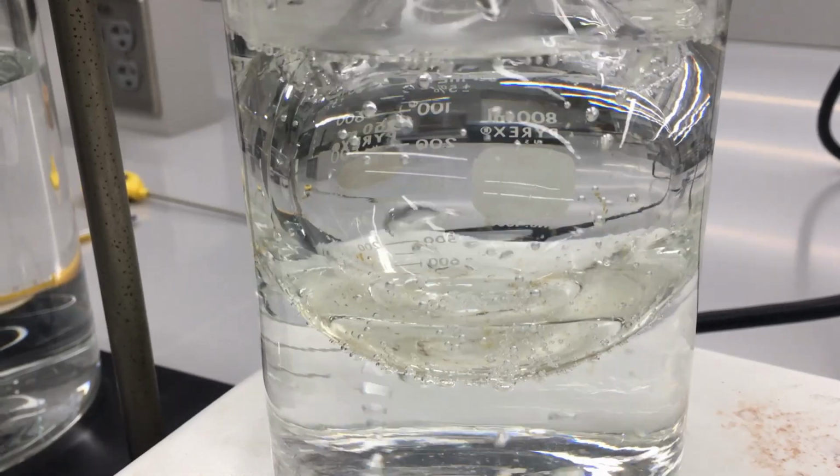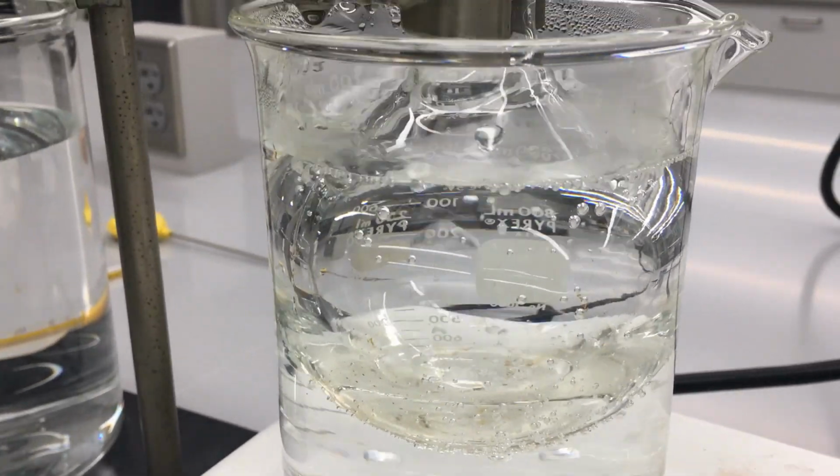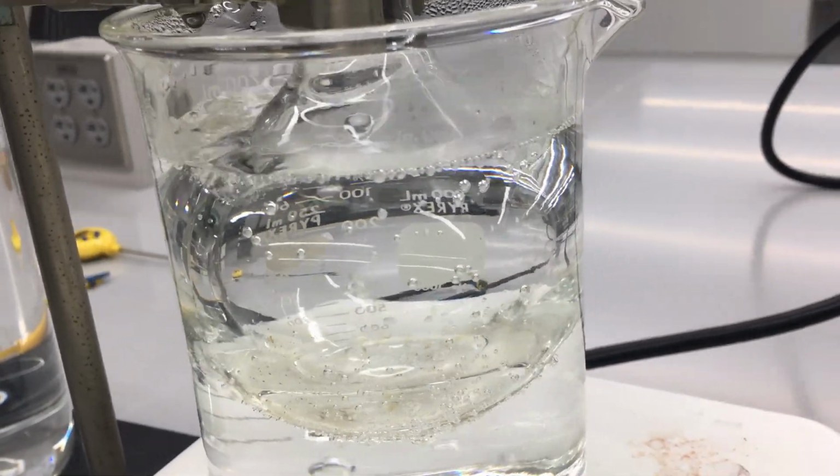See that pool of liquid is almost completely gone, showing that we've almost completely vaporized our volatile compound.